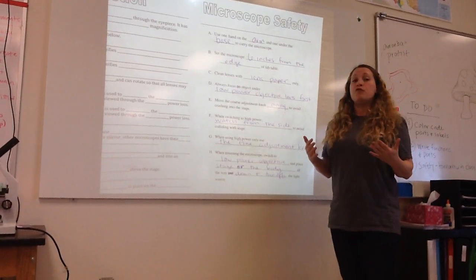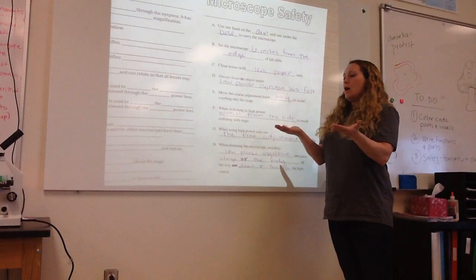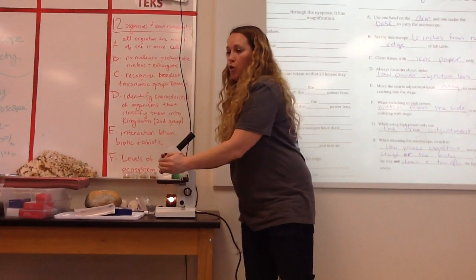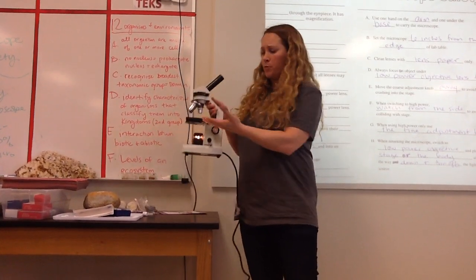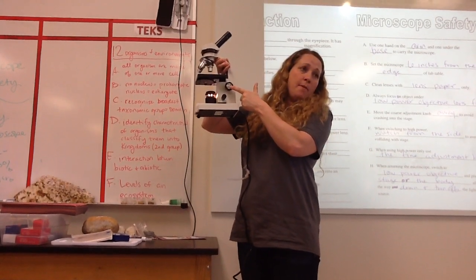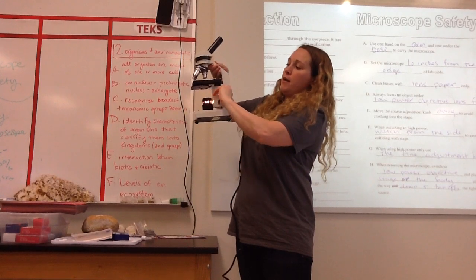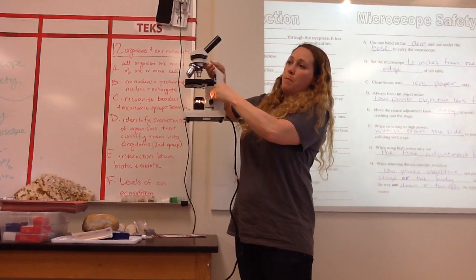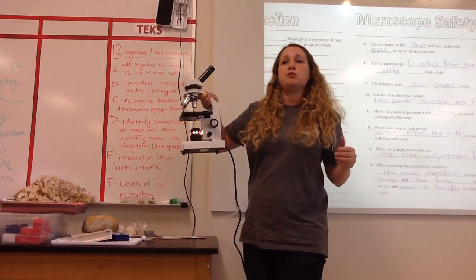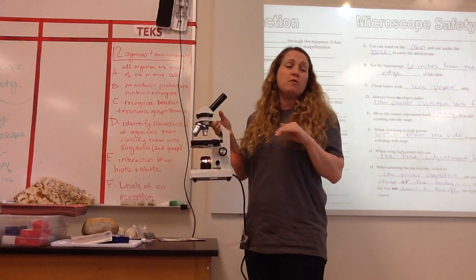Now, in order to view the object, this is where we have to talk about moving the stage up and down. Sometimes the stage is the moving part, and sometimes this part, the nose piece, moves up and down. In our microscopes, I'm pretty sure it's all the stage. I'm going to show you right now how to move it. You always start with the big knob. So when I turn it, you'll notice it goes up and down. Up all the way, down all the way. Up all the way, down all the way. It may not seem like much, but it doesn't need to be much because we are on the microscopic level, super tiny. So to change the focus, you only have to move a tiny bit.